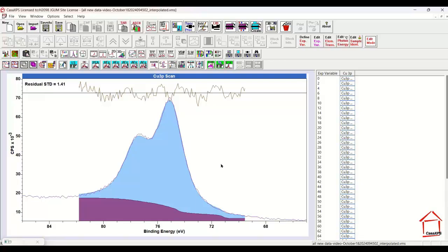But even so, it's possible that inelastically scattered signal from the platinum might contribute to the background shape, and that certainly seems to be an indication from the experiment I've just performed, that when I go up you can see where there's a little bit of platinum, that shape is there, and it is much more pronounced in these small peaks than the peaks themselves. So these represent photoemission signal that is scattered by either platinum or the copper en route to the spectrum that we see here, that is mostly representative of the copper.